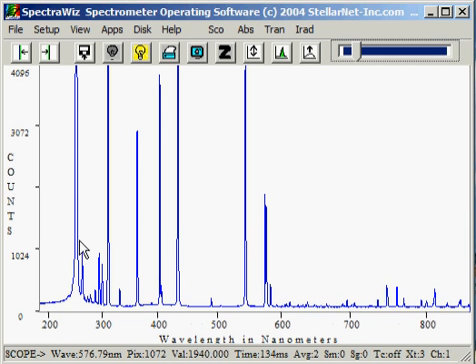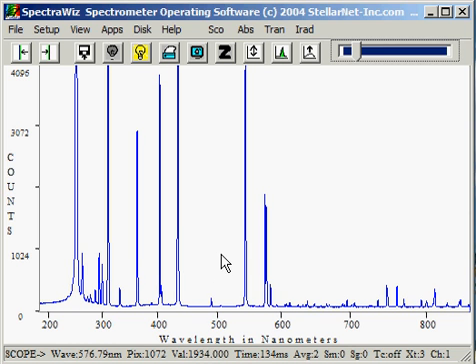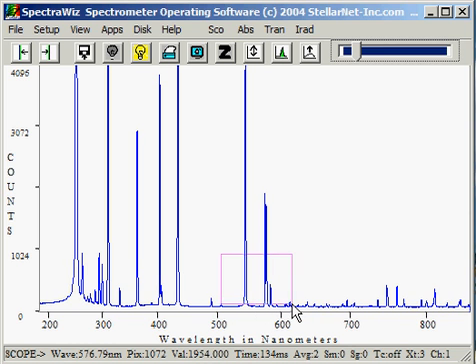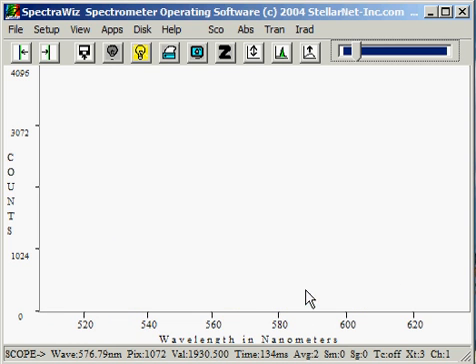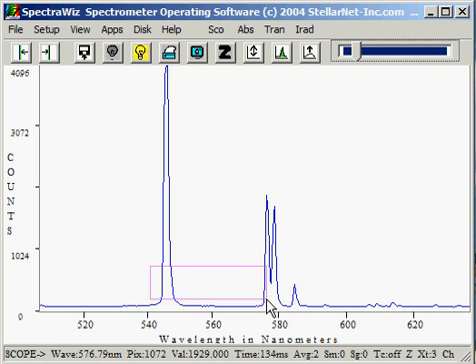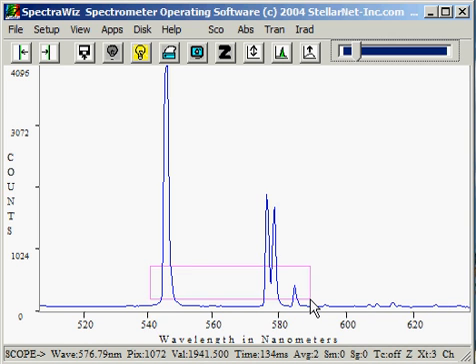Now we can see the full spectrum from the spectrometer. I'll zoom in again by left-clicking and dragging open a box. We can continue to zoom in by repeating the left-click, open a box, and release.